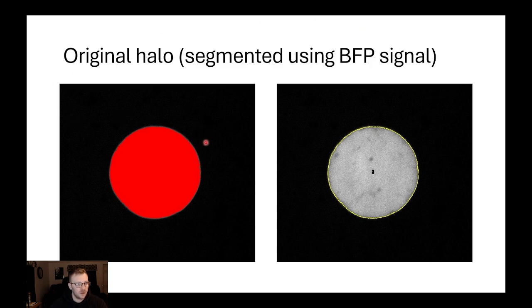So the first thing, right? This is that thresholding step. What I've told the software to do is to include all pixels of a certain intensity in this image. I believe my cutoff was like 300, and my maximum, I basically made it full bore. So my background pixels here won't be included in the intensity profile. And then I can tell it to measure that thresholded image and generate what's called a region of interest around the nucleus. That region of interest will measure the intensity of every pixel inside of that region of interest.